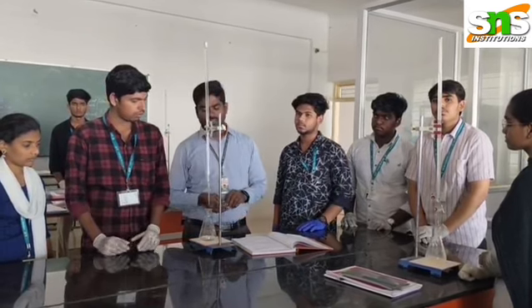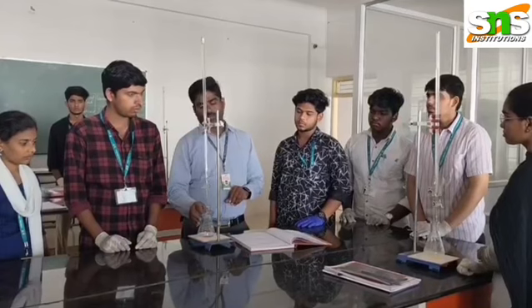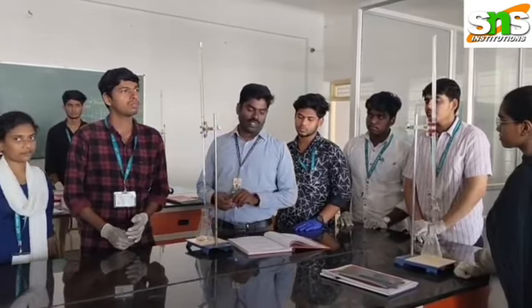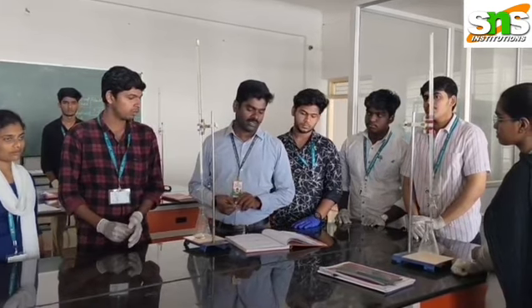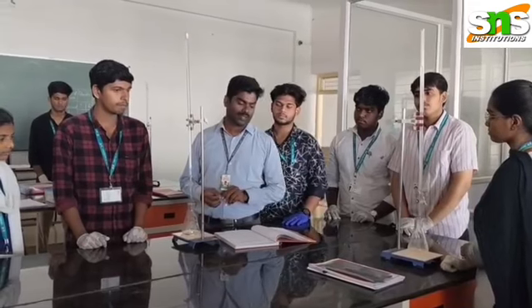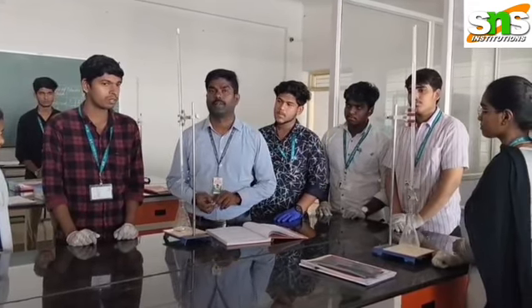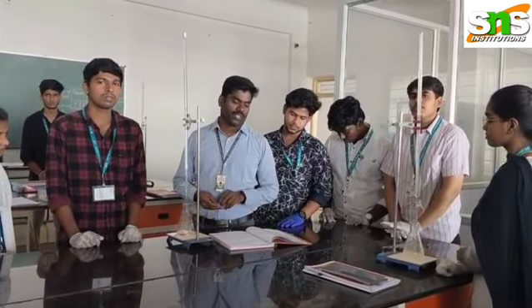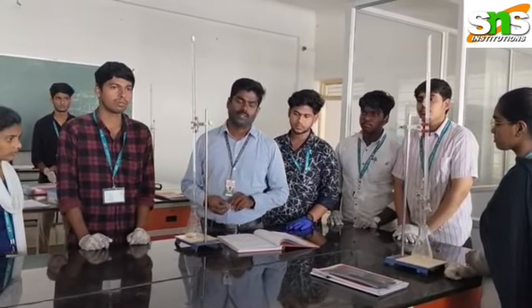With the preparation done, now we are going to do the standardization. In this standardization, we have to prepare the sodium carbonate solution of the needed strength. Today we prepared 0.1 N sodium carbonate solution. How did we prepare it?